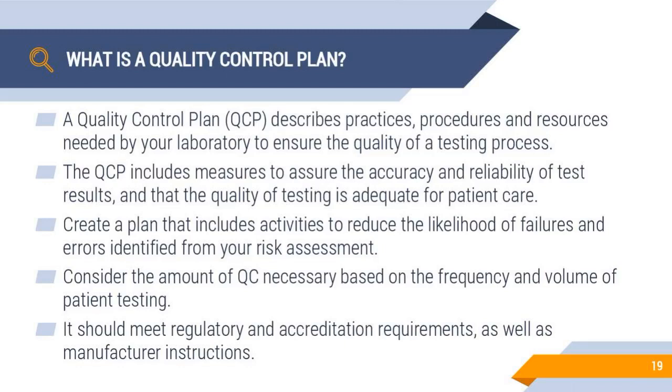I put it for the 5 modes or 5 components of risk assessment to measure their efficiency, to make sure they are done in a very good and quality manner, in order not to get any error. At the same time, I have already analyzed the hazard under each component, which is the potential errors, and I am reviewing my daily work in order to catch these errors before they happen.